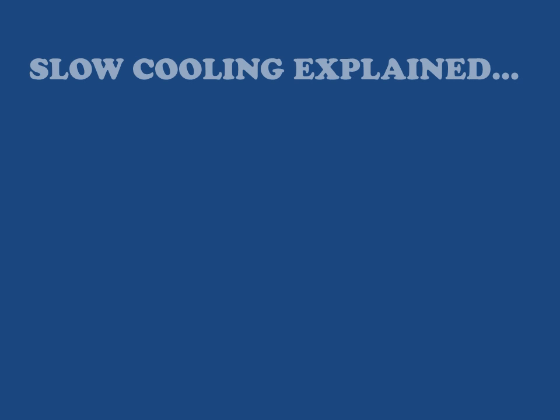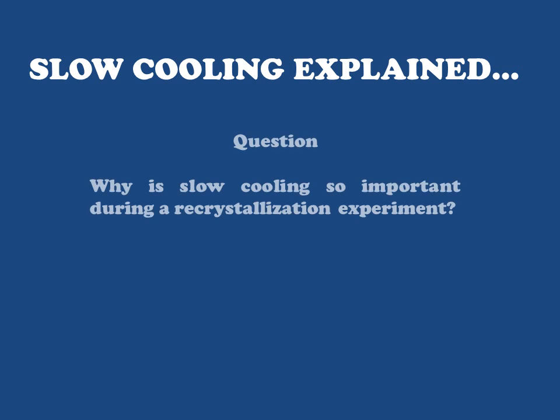Okay, let's discuss why it is that it's so important that we slowly cool recrystallization mixtures, because this is a very important part of the procedure.